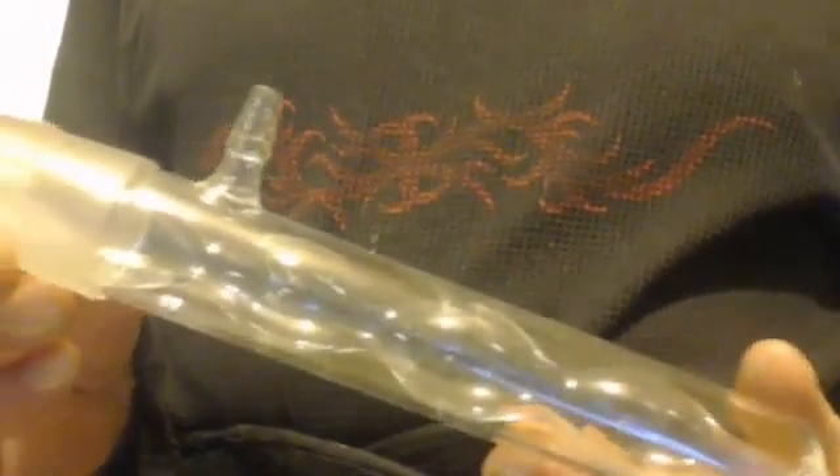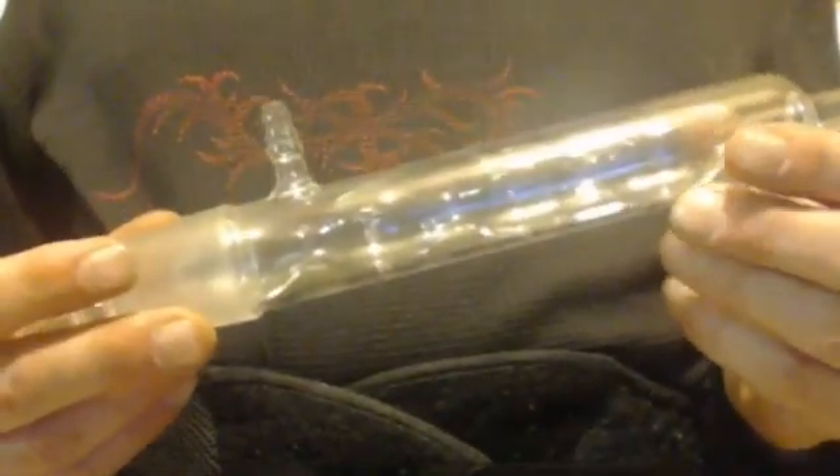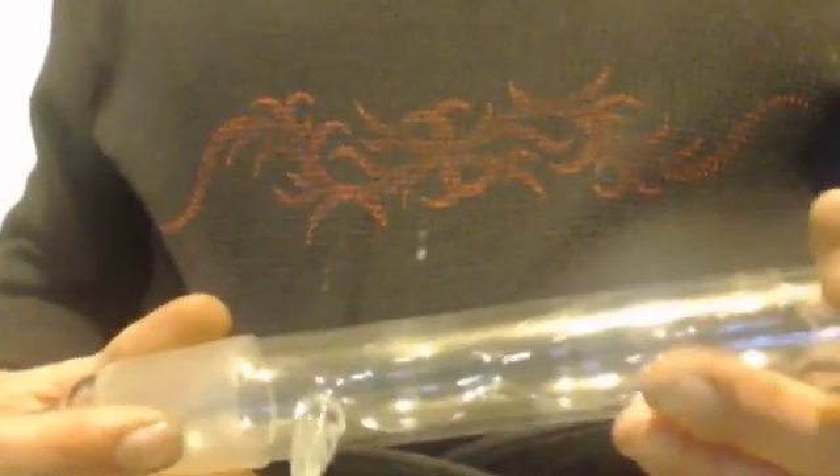Condensers are rated by one thing and one thing only in my mind — and that's by length, in millimeters. This one is probably about 100 millimeters. An average one is 300 millimeters, a big one would be like 600 millimeters. Prices for condensers are about $10 for every 100 millimeters you get. So a 200 milliliter condenser is like $20 to $25, a 600 milliliter condenser is like $60 to $65, and a 100 milliliter one is like $10 to $15. Every 100 millimeters of length, you're going to pay another 10 bucks.